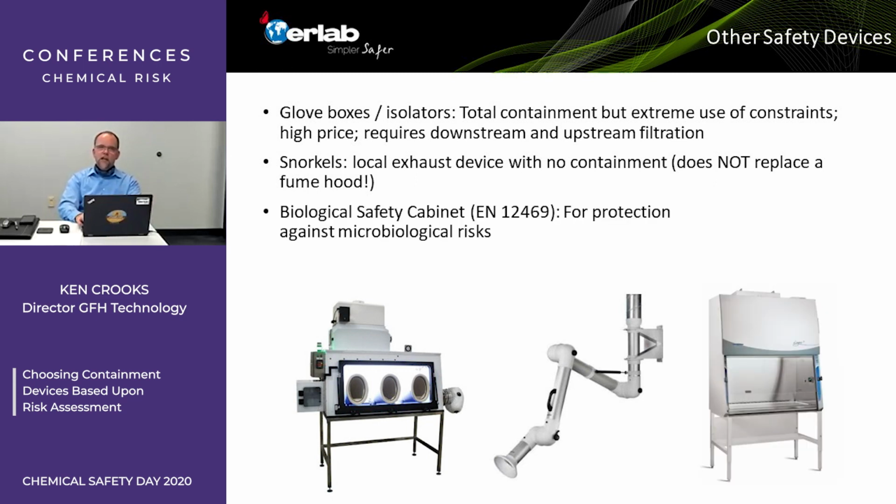And then lastly, biological safety cabinets, many different types, 3 different categories, different types within each one of those. I'm not qualified to speak about biosafety cabinets, but the manufacturers are very reputable. There are very strict rules and standards for these, EN 12469. There's also NSF 49 here in the United States, National Sanitation Foundation. So very strict standards. Manufacturers can help you out with selecting the appropriate one.